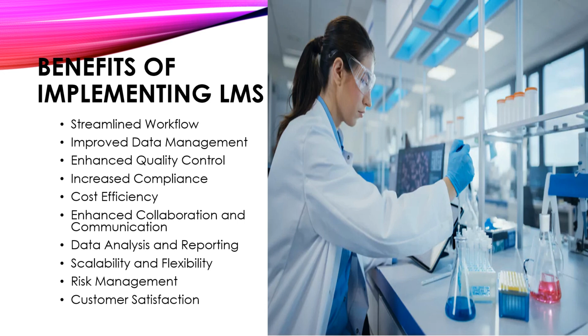sample handling, data integrity, and regulatory compliance. It enables traceability of samples, processes, and results, minimizing the likelihood of errors and adverse events. Customer satisfaction. Ultimately, laboratory management systems contribute to improved customer satisfaction by ensuring timely and accurate delivery of services, adherence to quality standards, and responsiveness to clients' needs and inquiries. This strengthens the reputation and credibility of the laboratory in the industry.